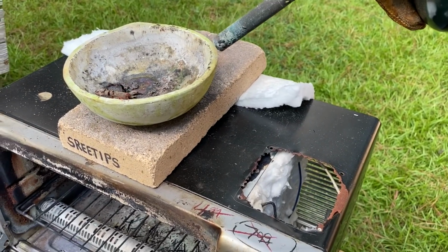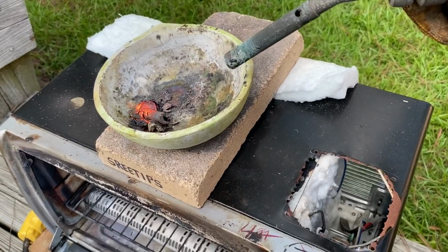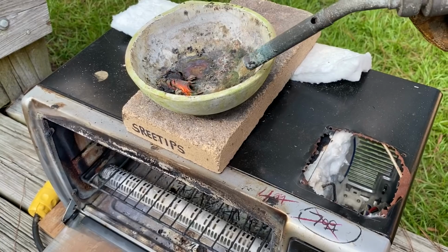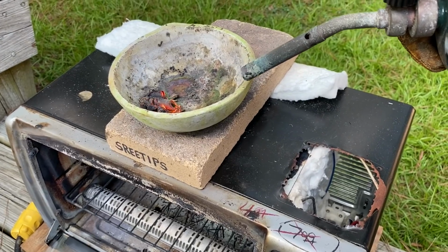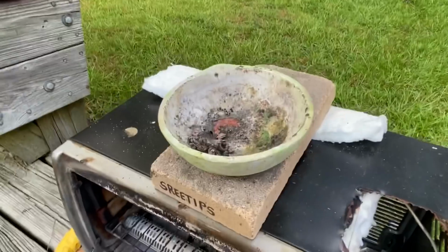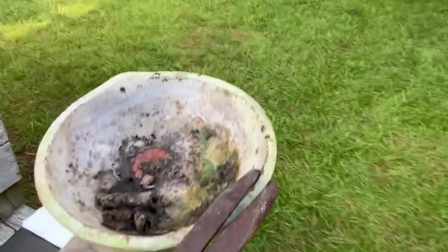Make sure it's all burned up. Everything's turning red. That's what we want to see. Try not to blow it out of the dish. I think we're pretty much incinerated now. I'm going to go to the next step. All right, now we're going to take it in and let it cool off. And we'll get this into a beaker.